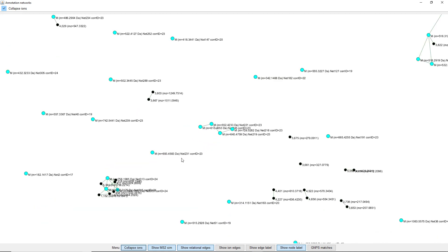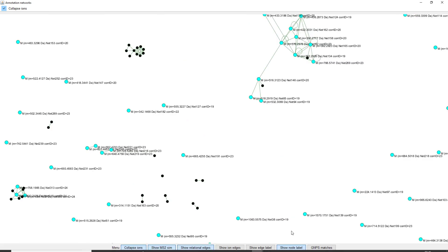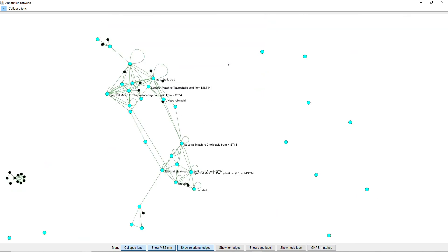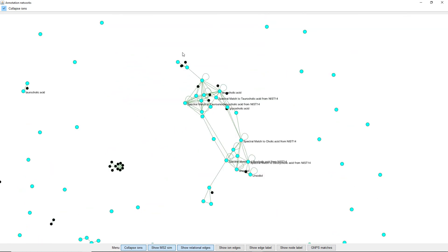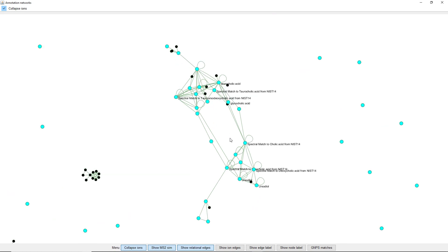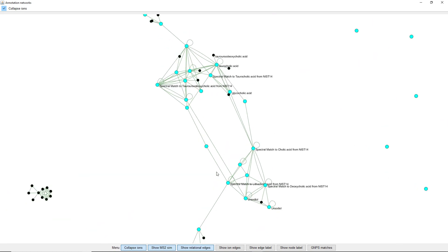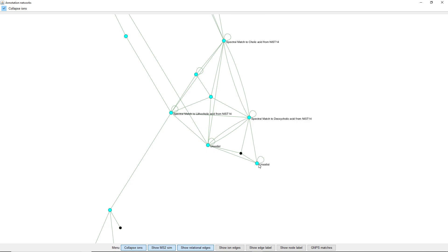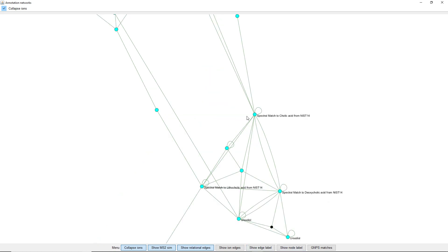We can zoom out and hide the labels, and just show the GNPS matches. Going to the bigger cluster, we can see we have plenty of neutral molecules: Osodiol twice — there are different isomers, so maybe one of the isomers — Cholic Acid, Deoxycholic Acid which is one of the isomers of Osodiol, and then Lithocholic Acid. Everything here makes total sense.